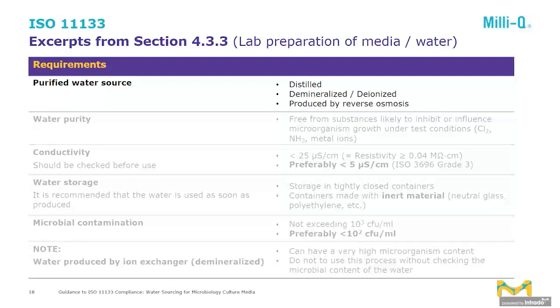So the first thing is, of course, it requires that you use a purified water source. So you have a choice. It can be distilled water, it can be demineralized or deionized water, it can be water produced by reverse osmosis, or an equivalent quality of water. So basically the idea is, of course, you would not want to use tap water. It needs to be purified quite a bit.